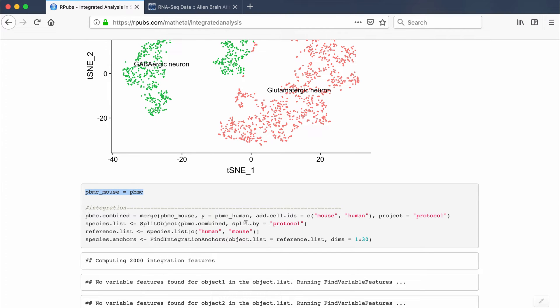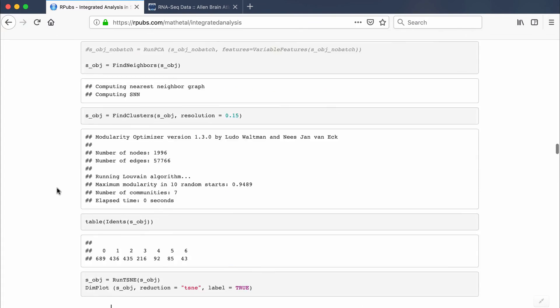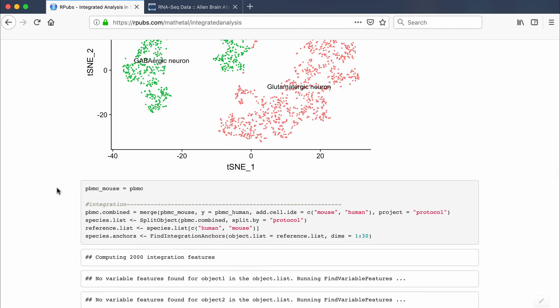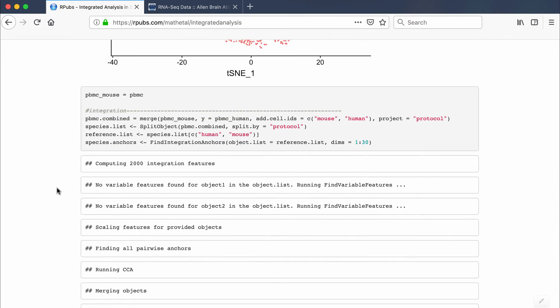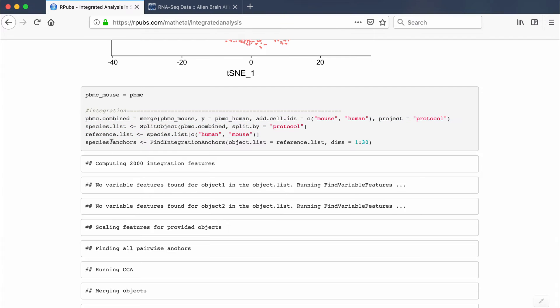At the integration section, I will have created two Seurat objects: one called pbmc_mouse and one called pbmc_human — both individually analyzed. For integration, I create a combined object using the merge function, merging the two Seurat objects separated by the 'protocol' category. Then I do a SplitObject by protocol, splitting into human and mouse, before proceeding to the anchoring step.